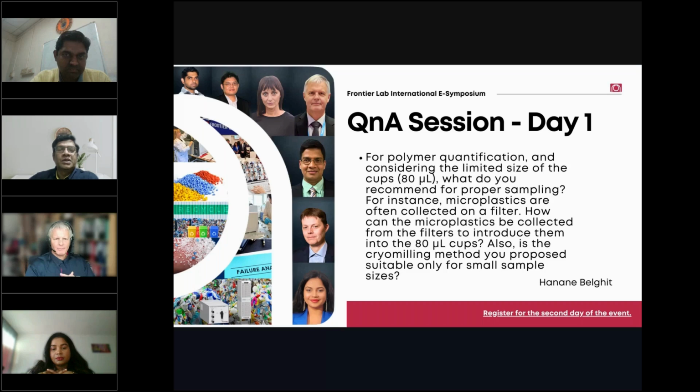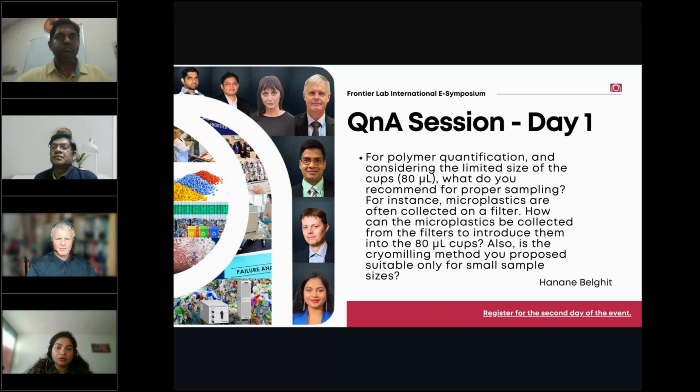It's quite a common question that can come up, because we have these small cups. The users who want to perform microplastic analysis wonder how they can put the sample inside. Very often the last sample preparation step is a filtration step on a glass fiber filter, an inorganic filter. Then the question is, how can I put the sample from the filter into the cup? But the solution is easy: you put the whole filter, including the filter cake, into the cup. So basically, you are folding. You need to have some practice maybe, but you take two tweezers, and you can really fold the small filter, which should not be bigger than maybe 1 centimeter in diameter, to make a small cake, and then using the tweezer put the whole filter, including the sample, into the cup and pyrolyze them together, because inorganic material does not disturb the analysis.